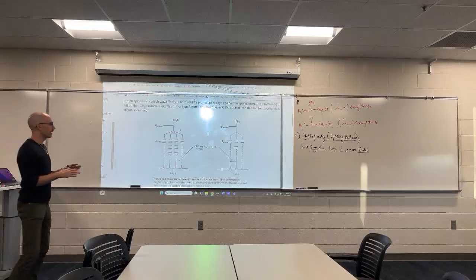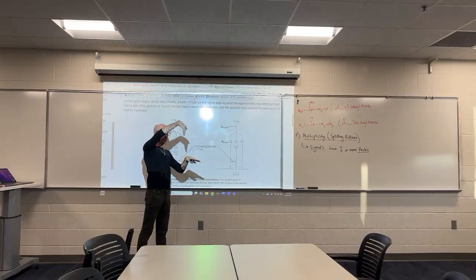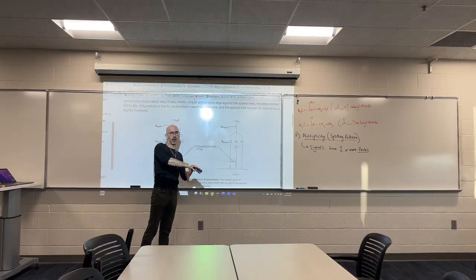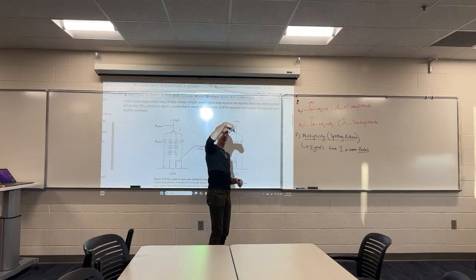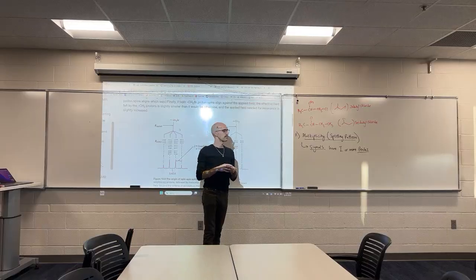A signal is where the baseline is left and then returns. And everything in between, all the little ups and downs before coming back to baseline, those are peaks on the signal. So earlier you sketched two signals, one was taller than the other. Those were both singlets, they had just one peak to the signal.